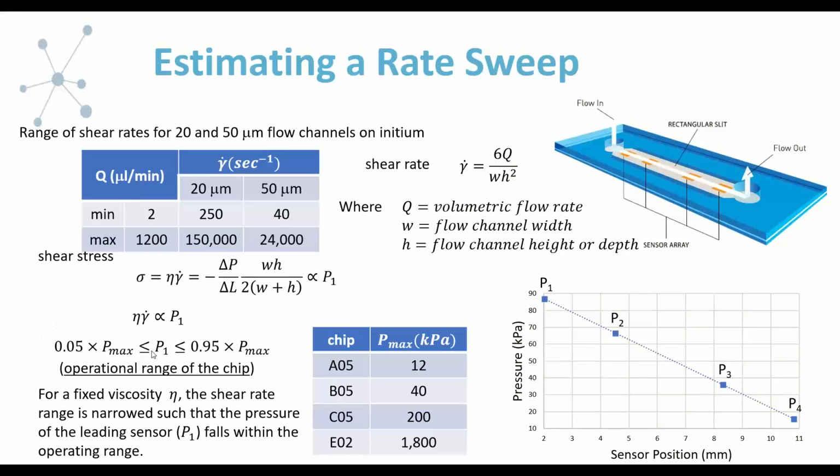And so when you multiply your viscosity and your shear rate together and you get your pressure, you can then visualize, okay, I'm using an A chip, is this combination of viscosity and shear rate going to be greater than 12,000 pascals? If so, then the A chip is inappropriate, but maybe the B chip is appropriate, and so on and so forth.